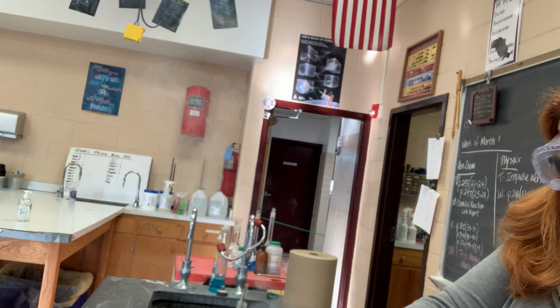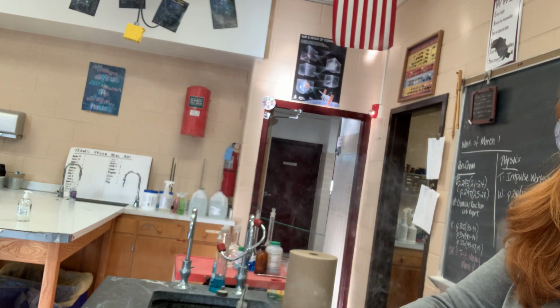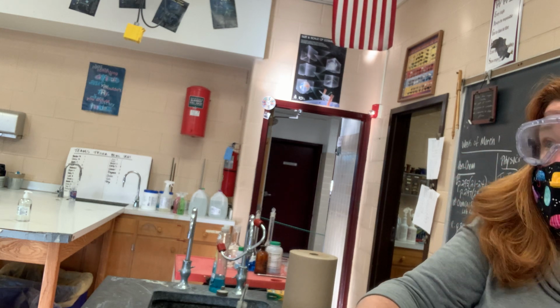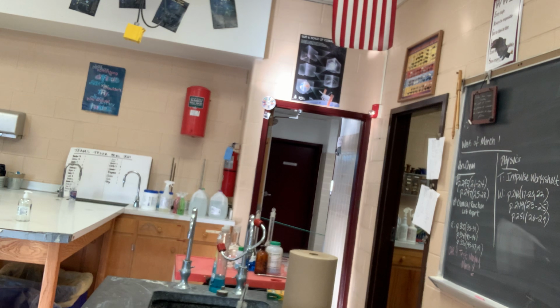Afterward, so those were the reactants. You've got to figure out the reactants. Remember how burning goes. Magnesium burnt in something, and it produced something else, and it's a synthesis reaction. The product is white and powdery and brittle. I can poke the crucible tongs in there. So before description, after description, how do you know that there was a chemical reaction? And then eventually, maybe not right this second, you're going to write the balanced synthesis equation for what just happened.